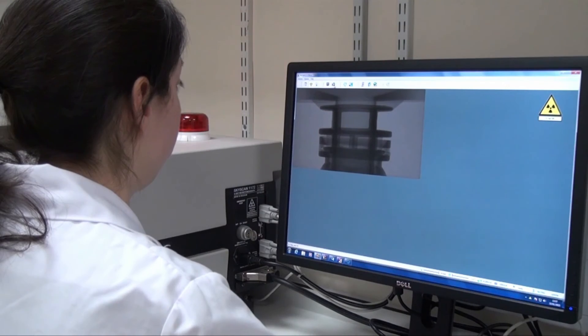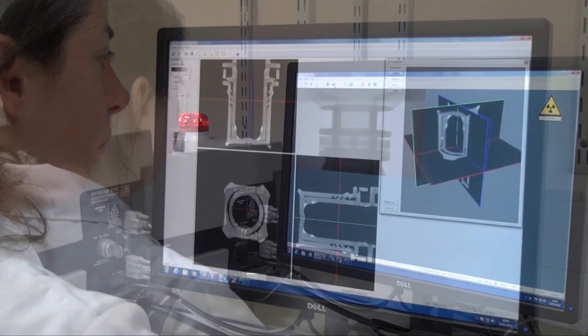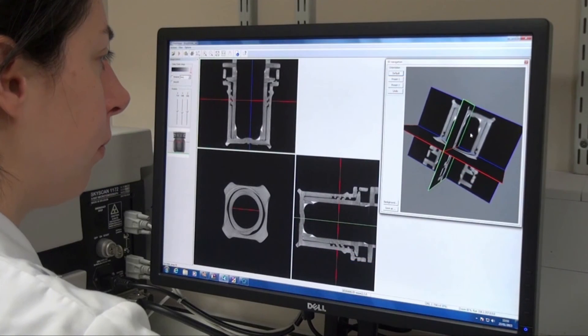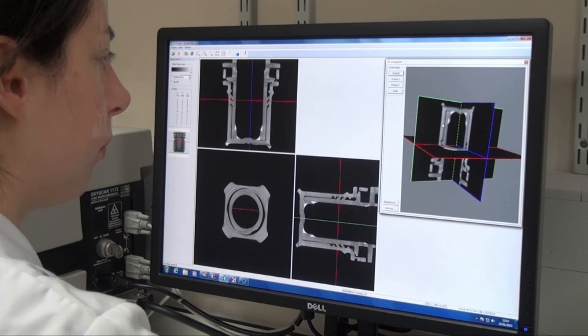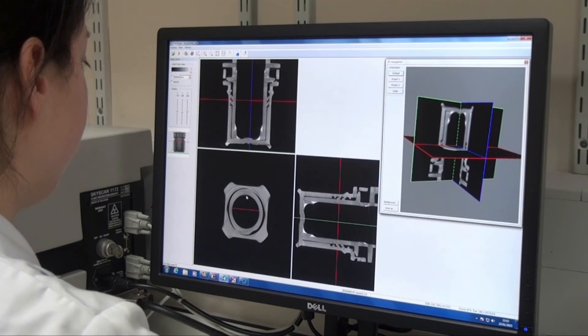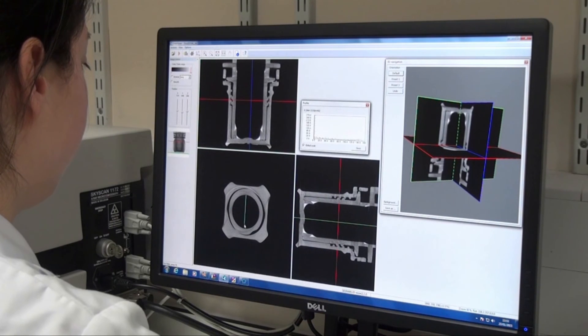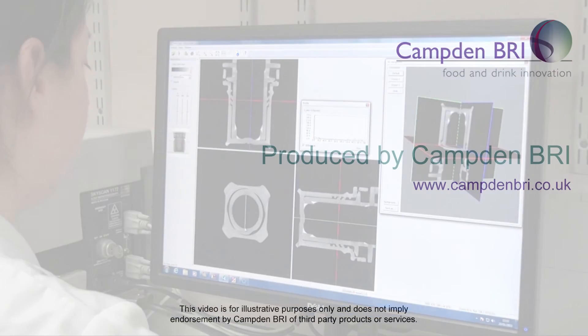X-ray micro CT can also be used to look at food packaging. It's particularly helpful when there's a problem with the food packaging, such as a defect somewhere. X-ray micro CT can look inside without having to destroy the packaging sample, identify where the defect is, and determine how that has affected the product inside it.